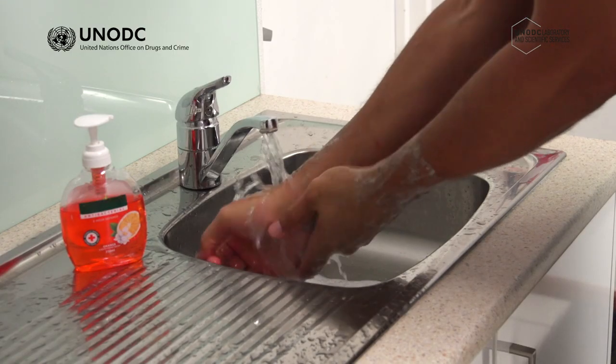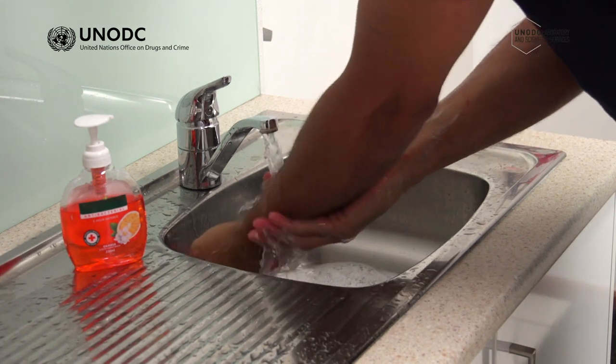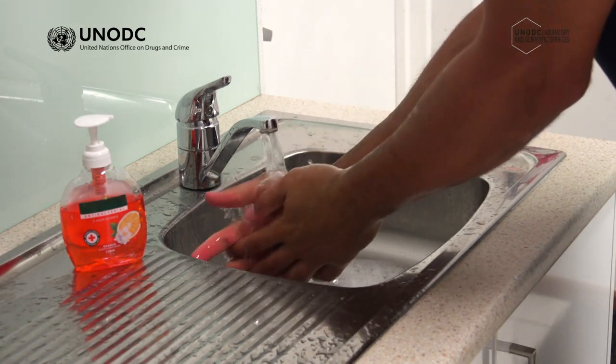Finally, your inner nitrile gloves can be removed. Once all PPE has been removed, you should always wash your face and hands before drinking or eating.